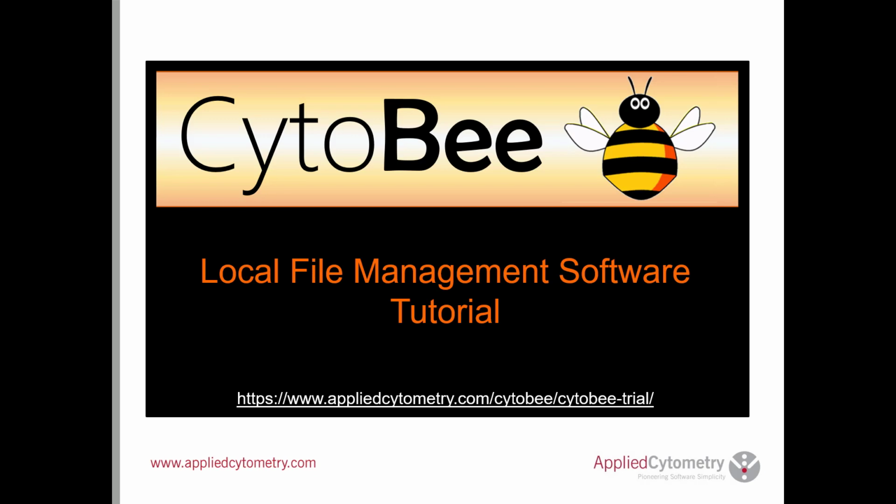This tutorial has been made to introduce you to Cytobee and help you get started using the software.